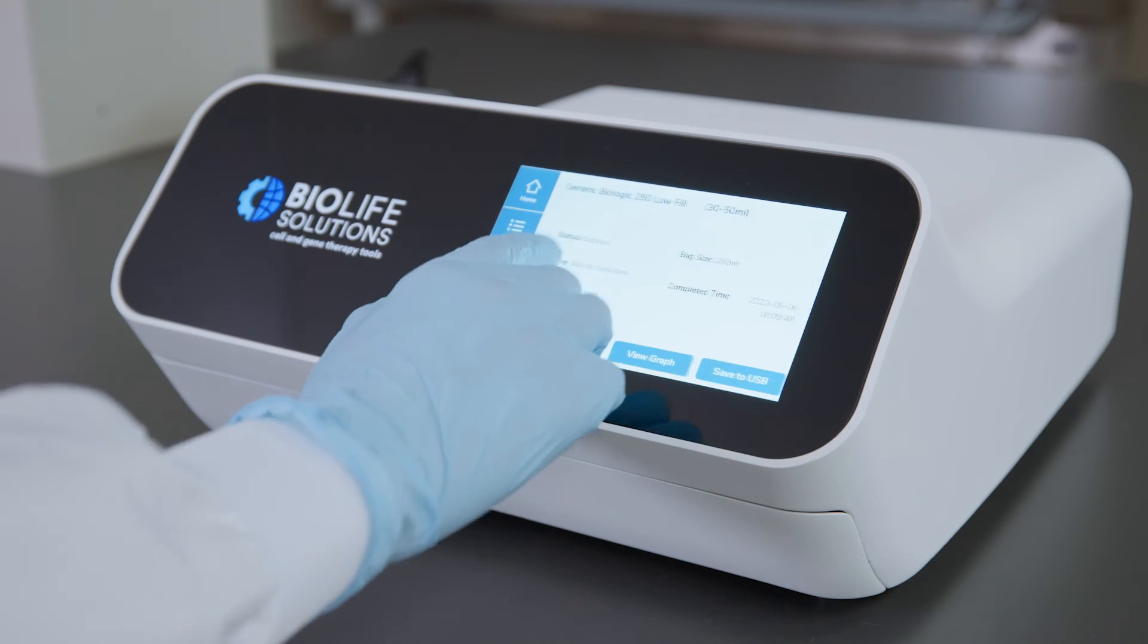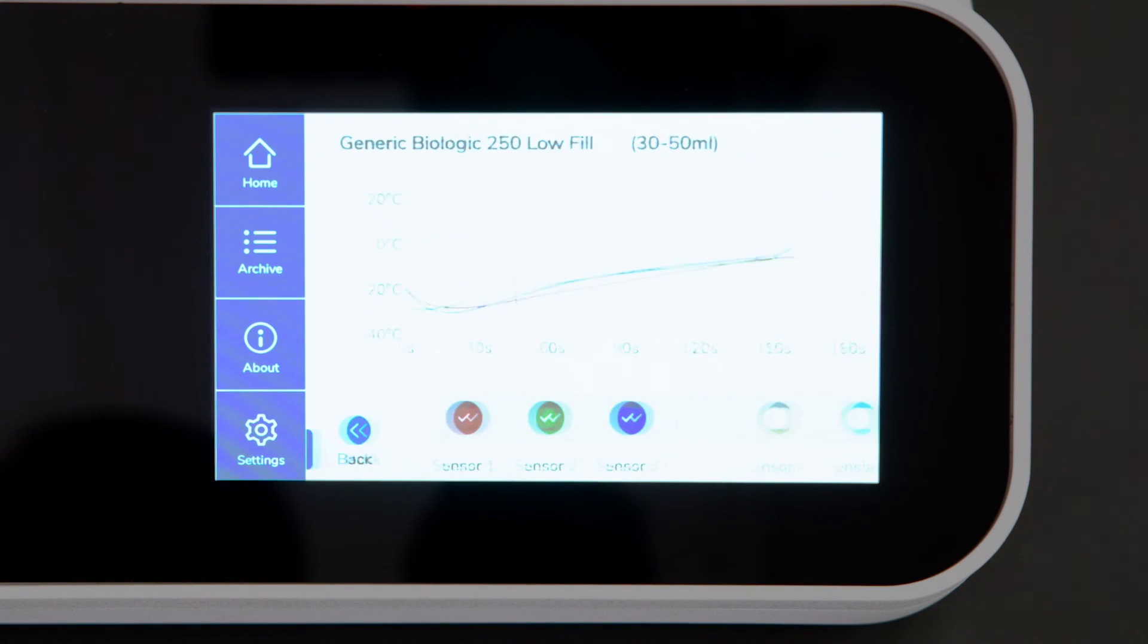All thawing data are automatically saved and can be downloaded to a USB memory drive for processing.